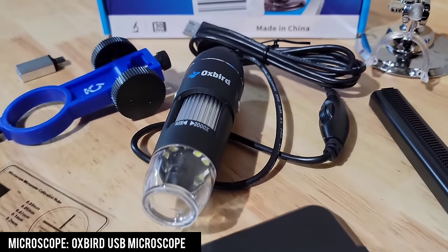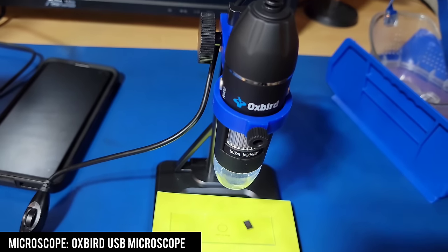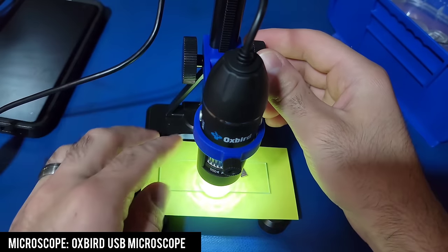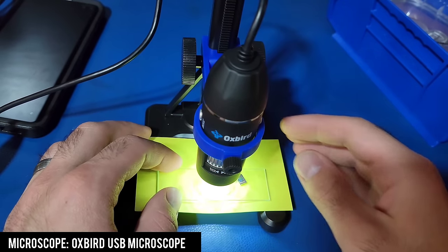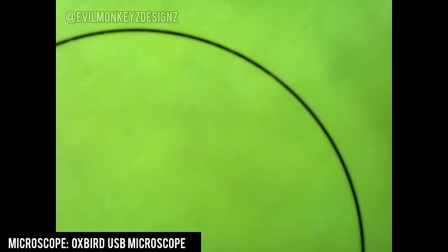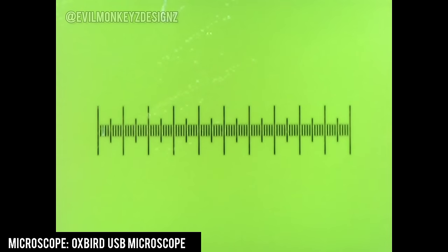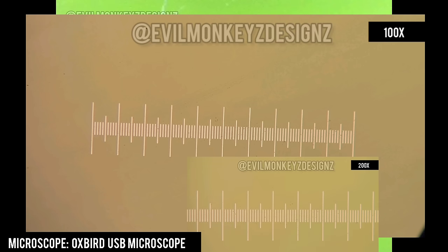Next up is the Oxbird USB microscope, which boasts a maximum magnification of 2000 times. It comes with an adjustable stand to help adjust focus. Unsurprisingly, Windows reports this is also a 0.3 megapixel sensor capable of 640x480. The image quality is very similar to the previous microscope. Zooming in to take a photograph at the highest magnification, I can overlay the various photographs and conclude this looks exactly like 100 times magnification. If it were 200 times magnification we would expect to see fewer divisions — so far this microscope is pretty similar to the previous one.